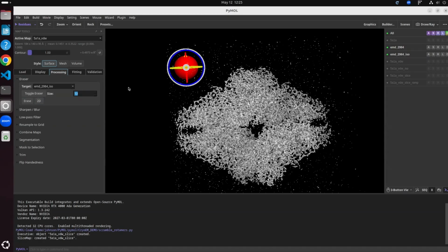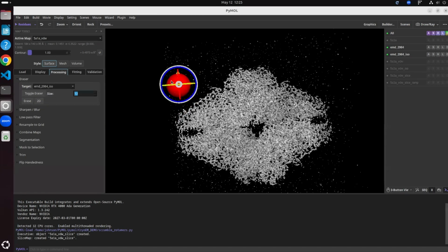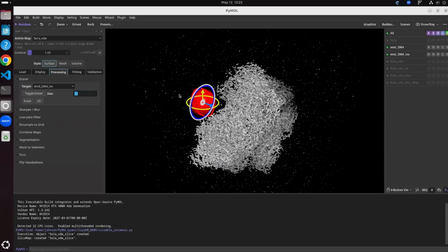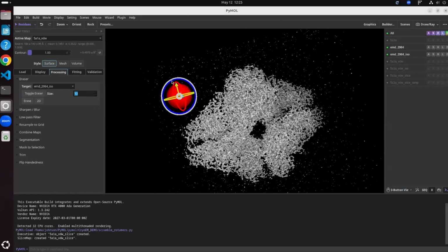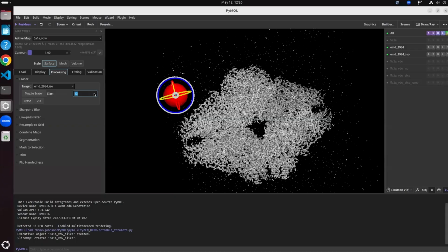It may be more convenient just to do this as a 2D projection. To give you an example of what that would look like, even though all this dust behind this eraser falls outside of the sphere, if you project it onto 2D space and click erase, I might need to increase the eraser size here, and then erase, and then tab it off.